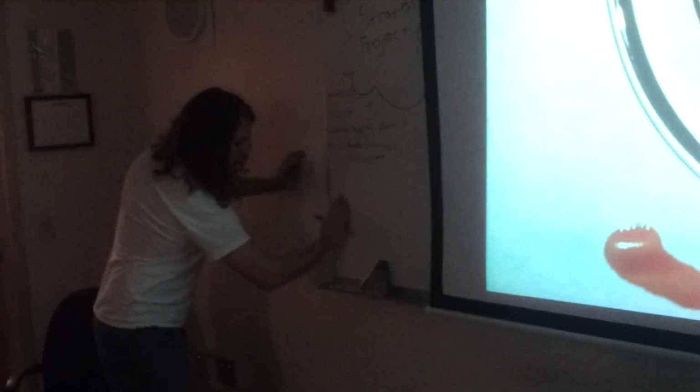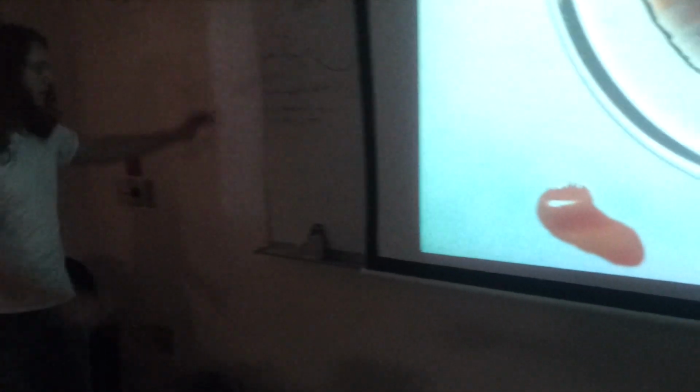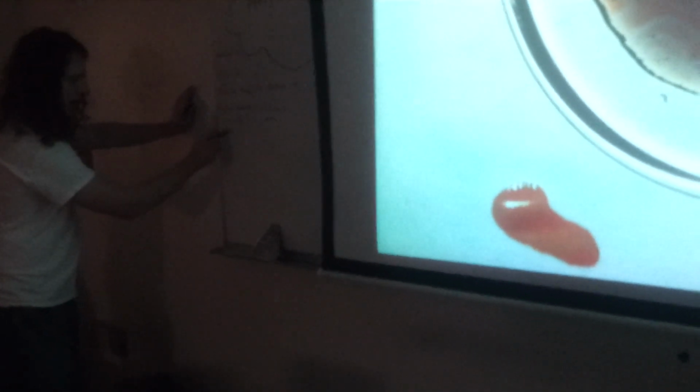But when you have this kind of reaction where it inhibits itself and then it activates itself, what you end up having, instead of that exponential decay, is an oscillatory motion. It's like an undamped chemical equilibrium or a lightly damped chemical equilibrium. And that's what's cool, because this will go on for over an hour if you let it go.